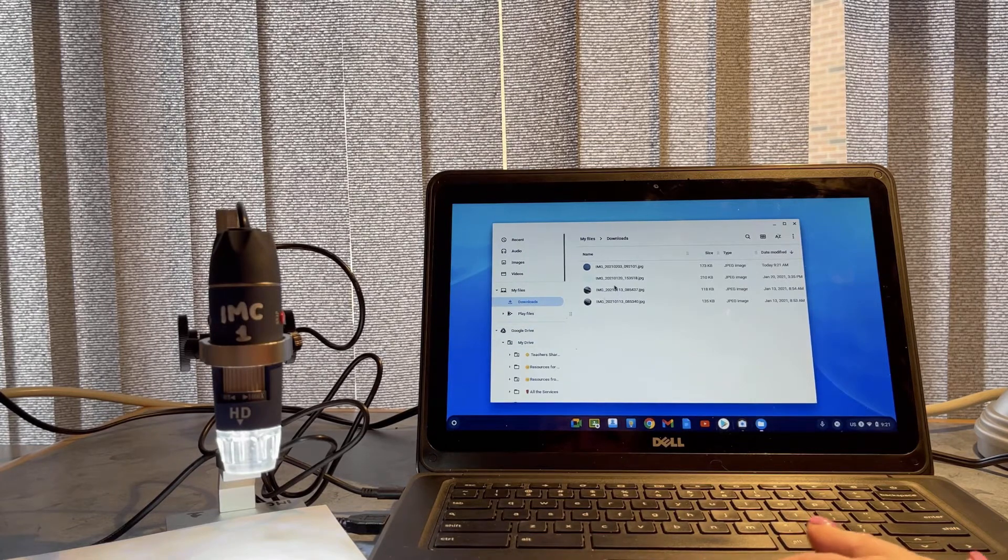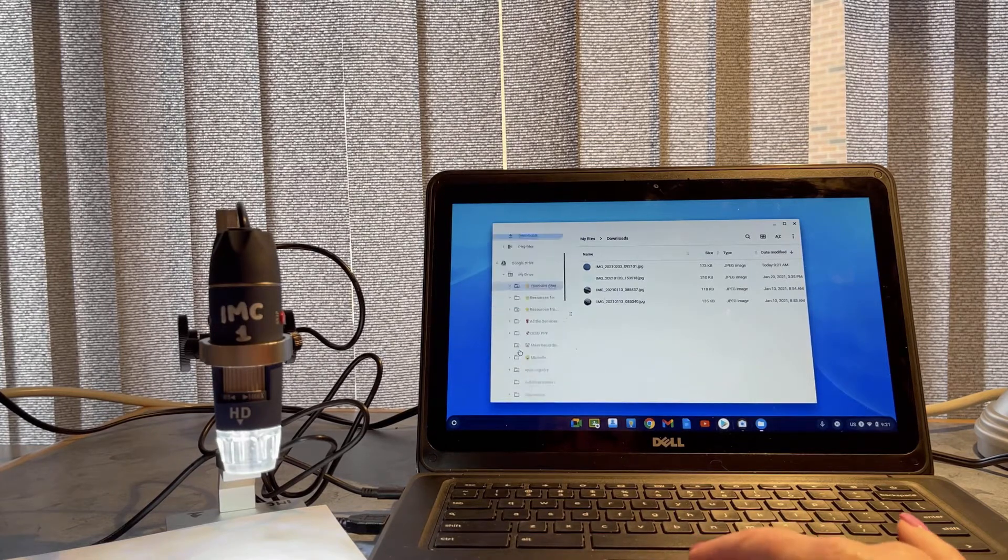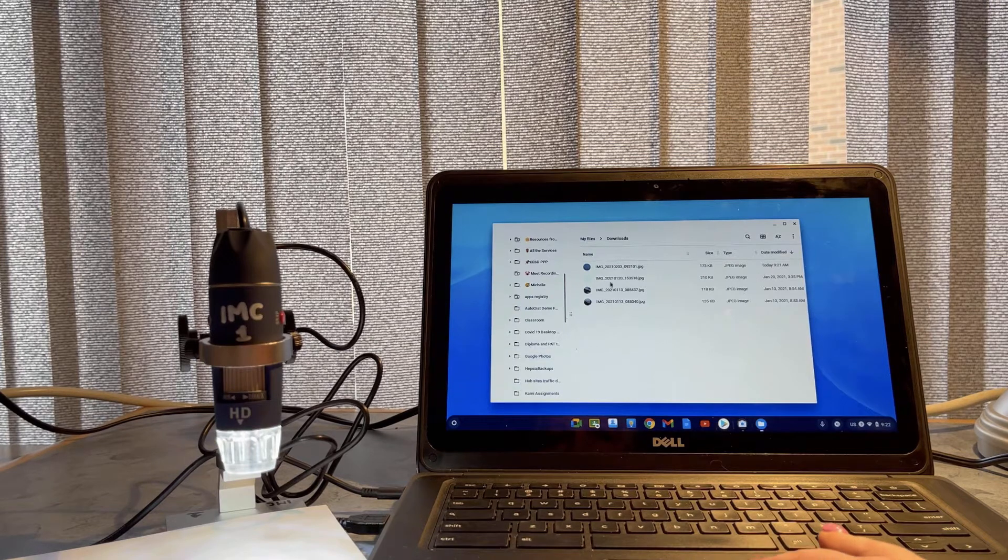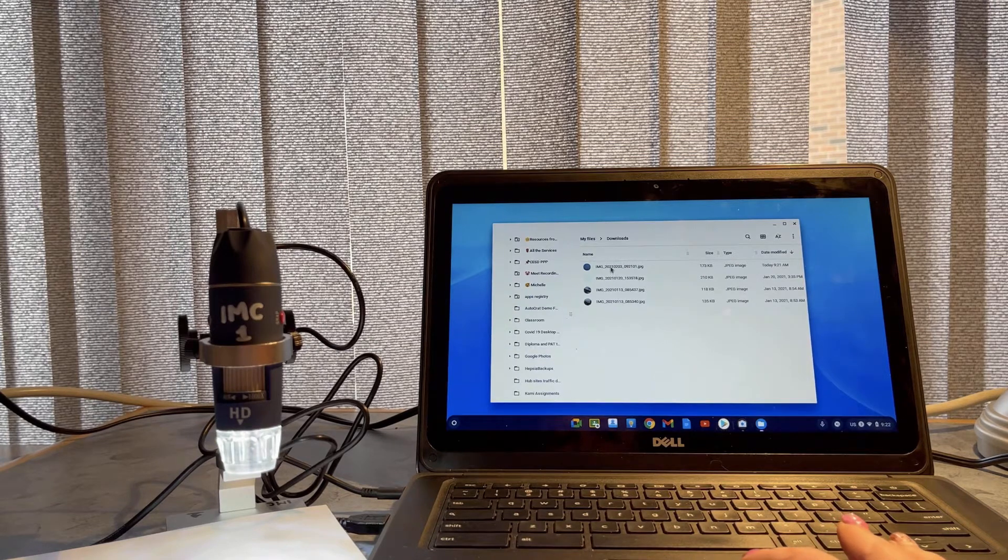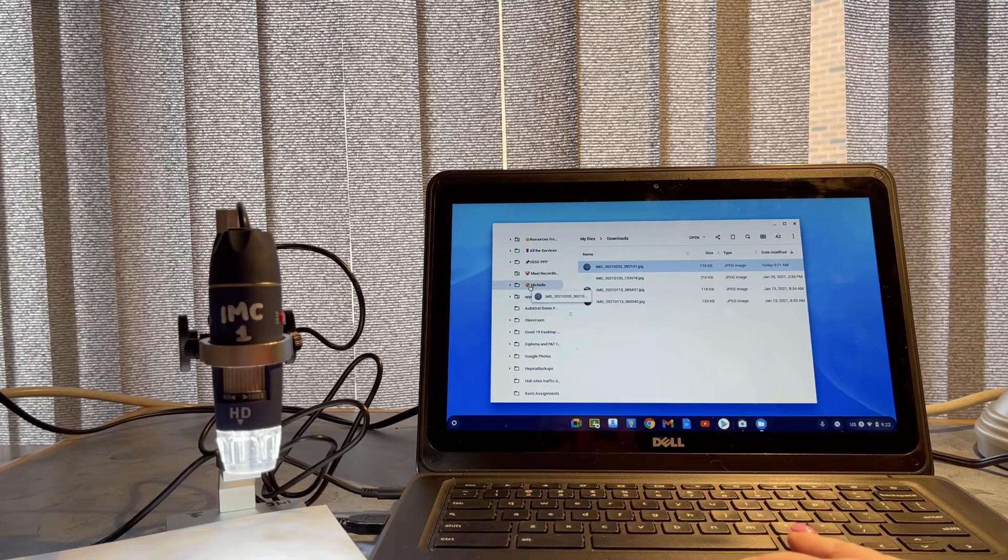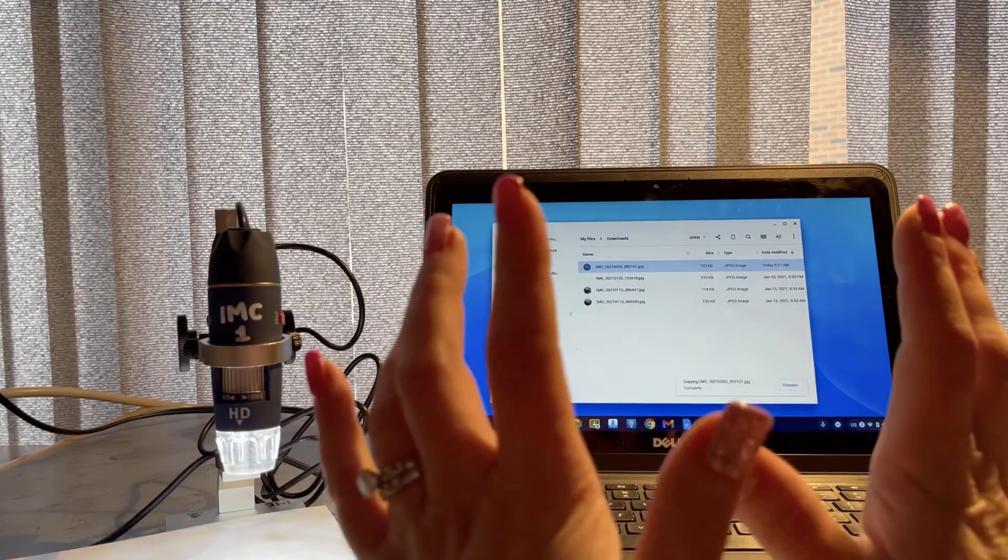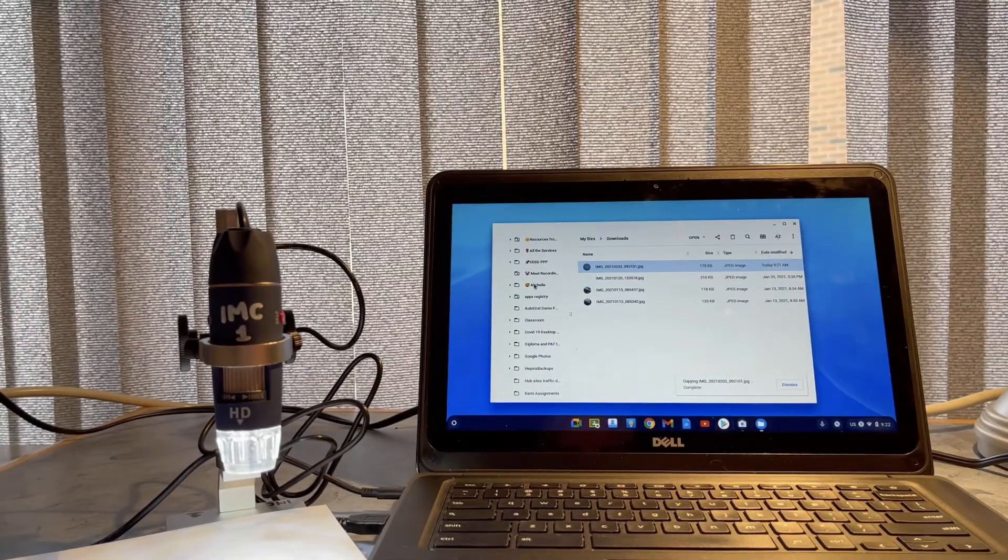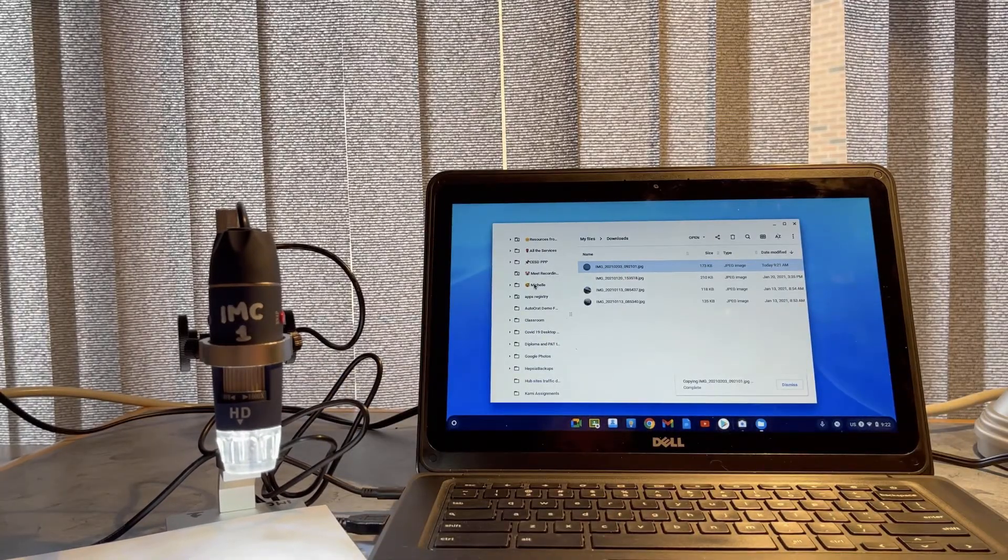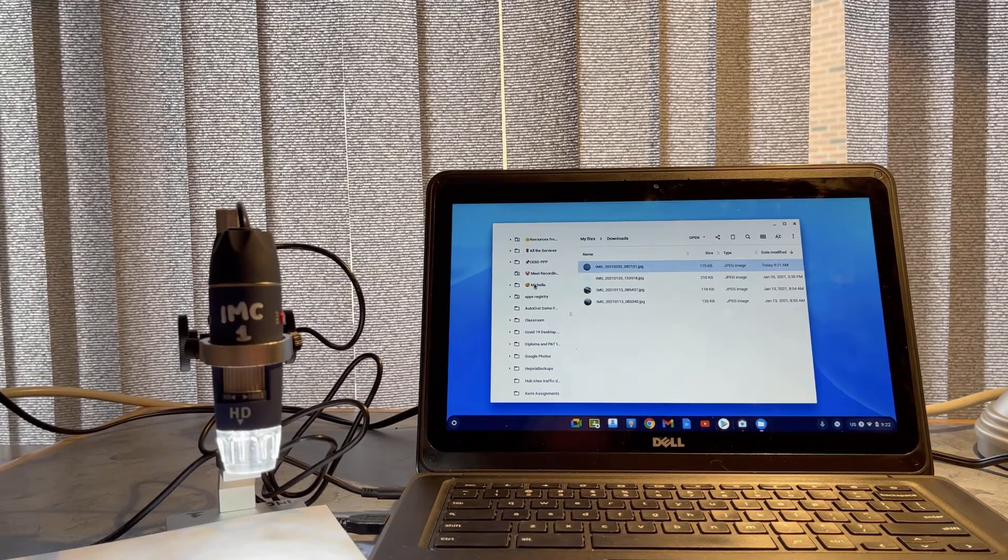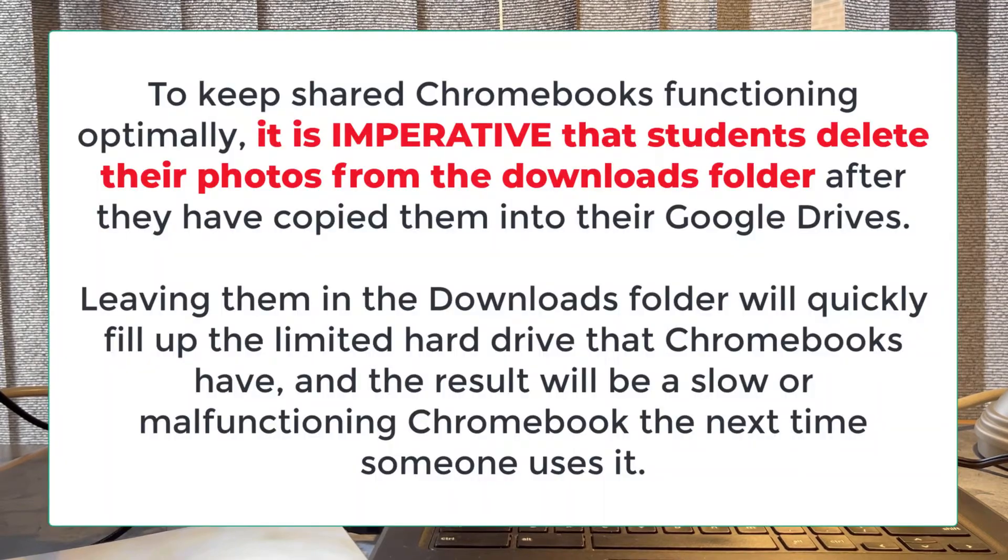I'm going to drag these into whichever folder I want to put them in on my Chromebook. That's the long and short of using the digital microscopes with a Chromebook.